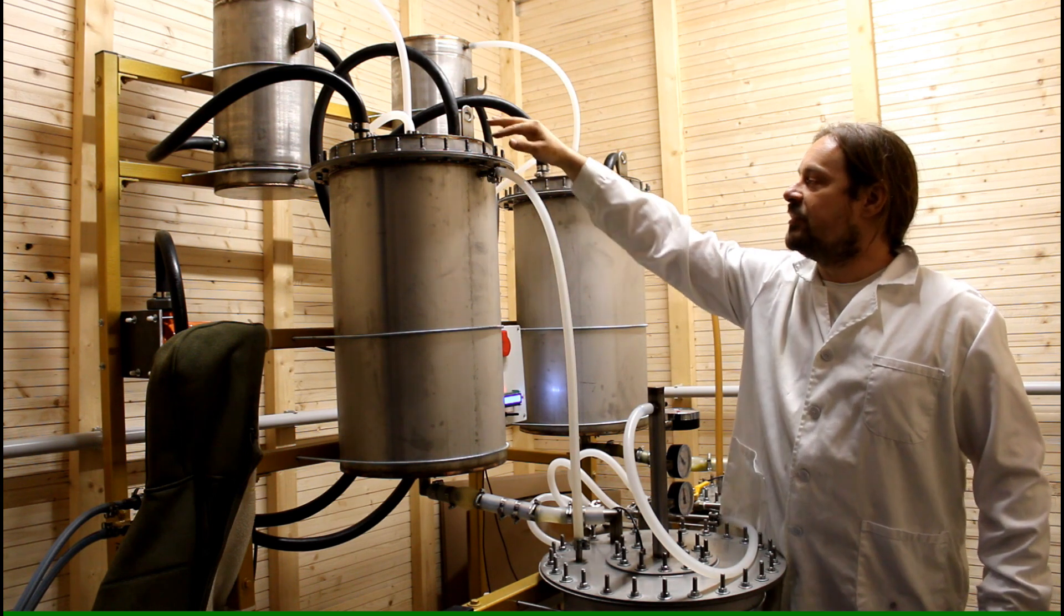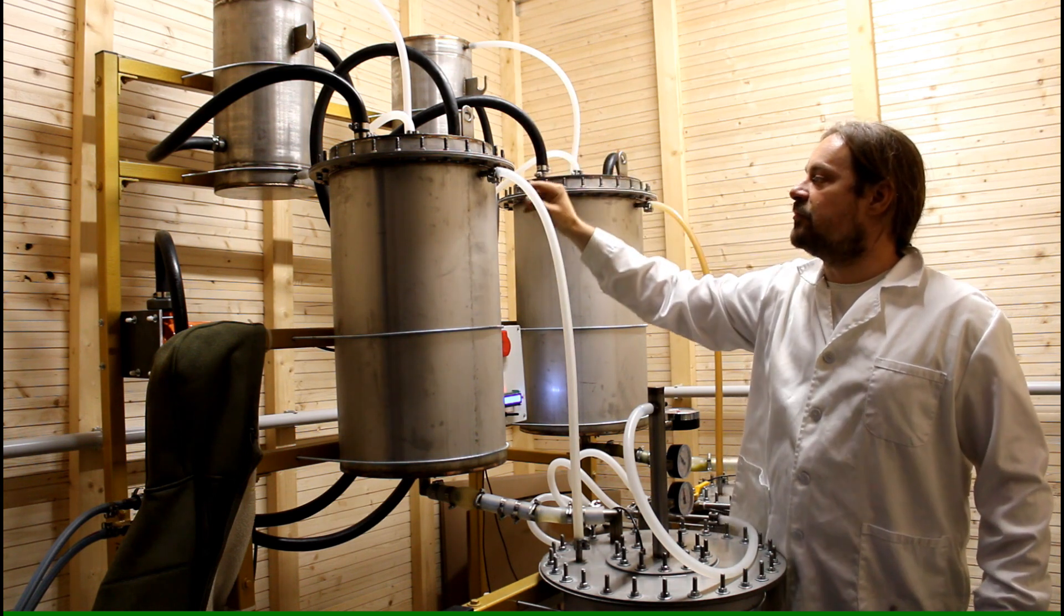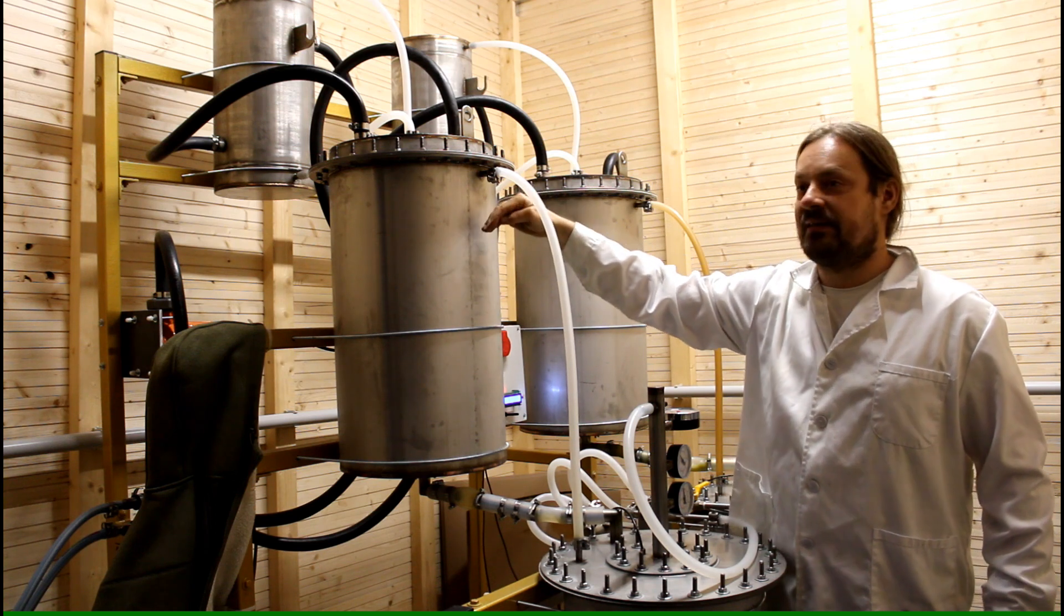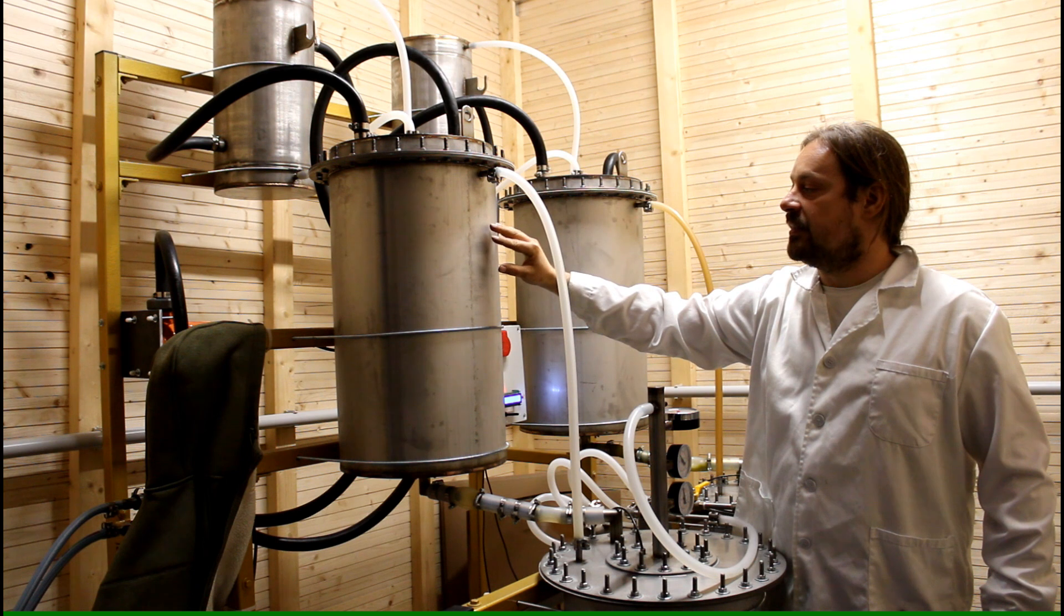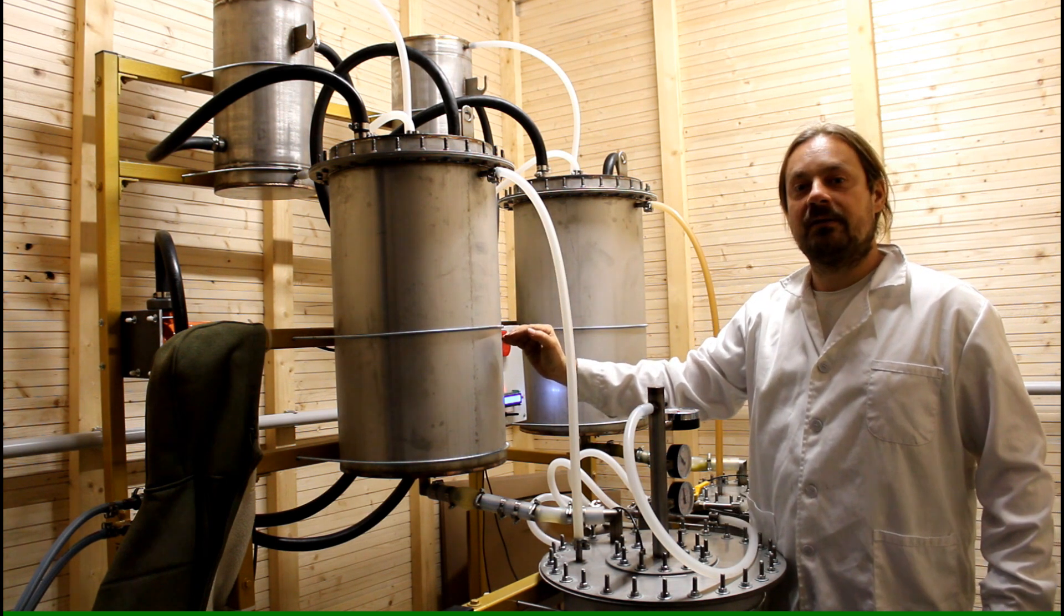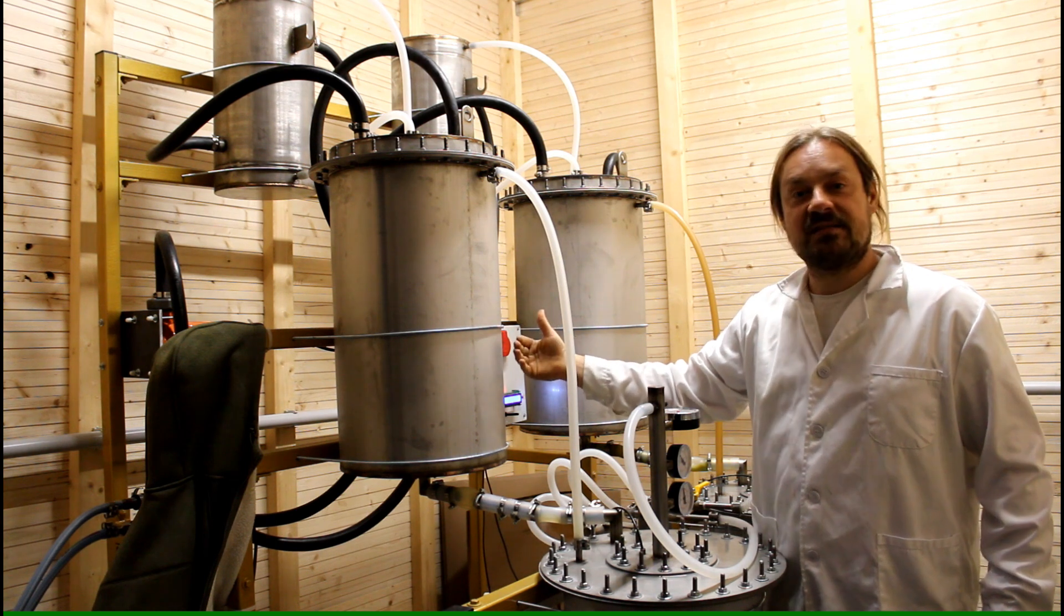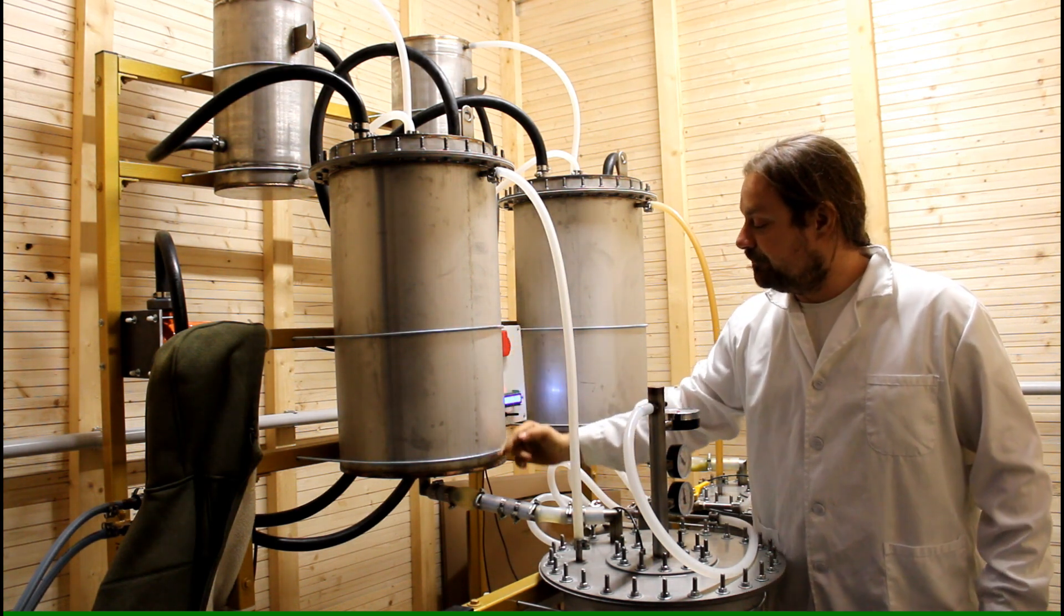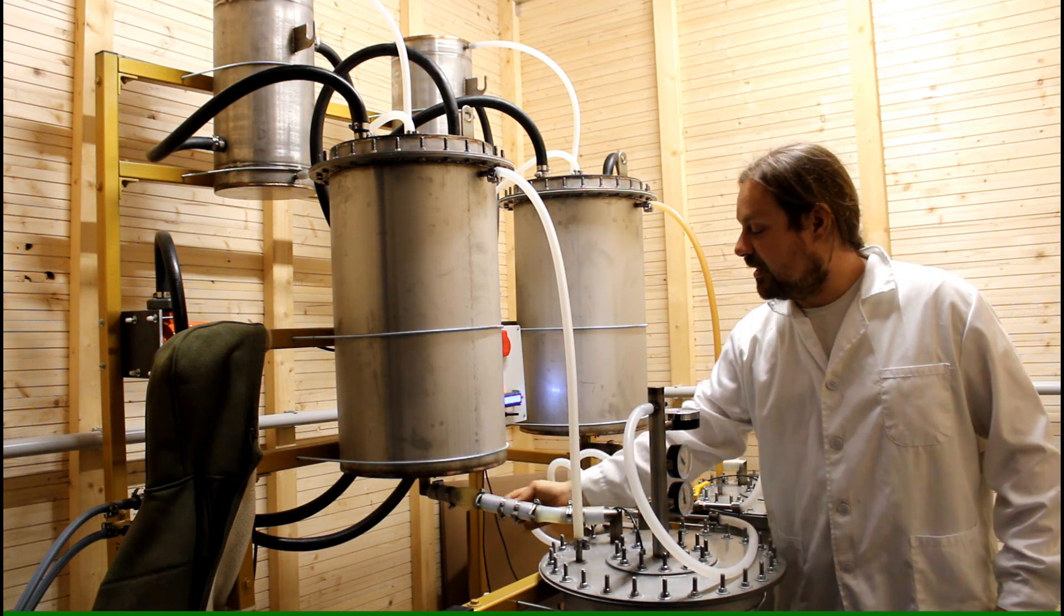All the liquid that condenses here and comes down from there will subsequently drop on the herbal matter and the solvent is running through the herbs. It will extract the substances of the herb and subsequently the extract will come down here and run in this vessel here.